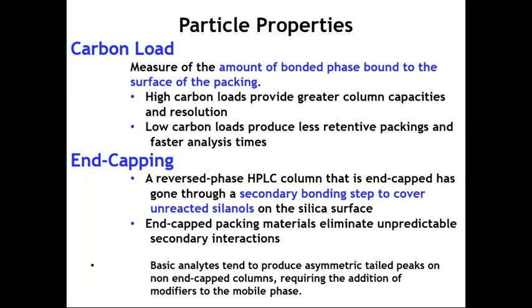So you see, when the chemistry is done on the silanols, not all the OH groups will take the C18 or the C12. Some of them may not, and those will now react, and you will see some sort of distortion in the peaks. So to prevent that, end capping is done, to block all the unreacted OH groups.